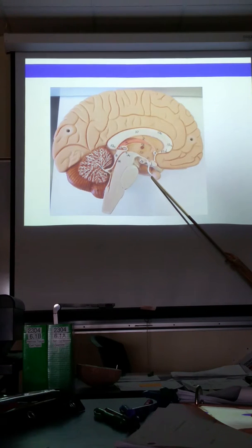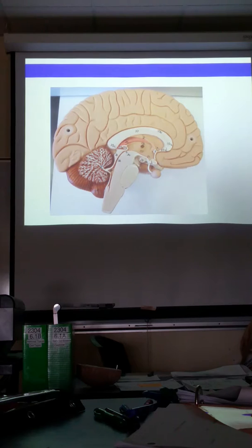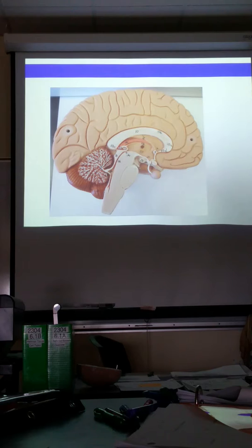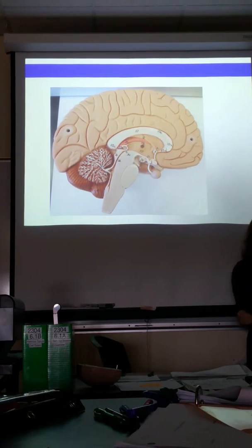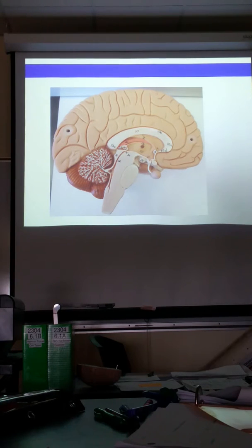We're not going to have the pituitary gland on our brains, guys. We're not going to see it. We are going to see 2 of the 3 meninges. Remember the meninges. You watched the video on that. The outermost meninge was the dura mater. Second one, arachnoid mater. Pia. We're going to see the arachnoid and the pia. Because when they take the brains out, these are sheep brains, they take off the dura mater and it comes off, and the pituitary gland comes off too. It's sitting in that sella turcica of the sheep skull, and so it comes off.